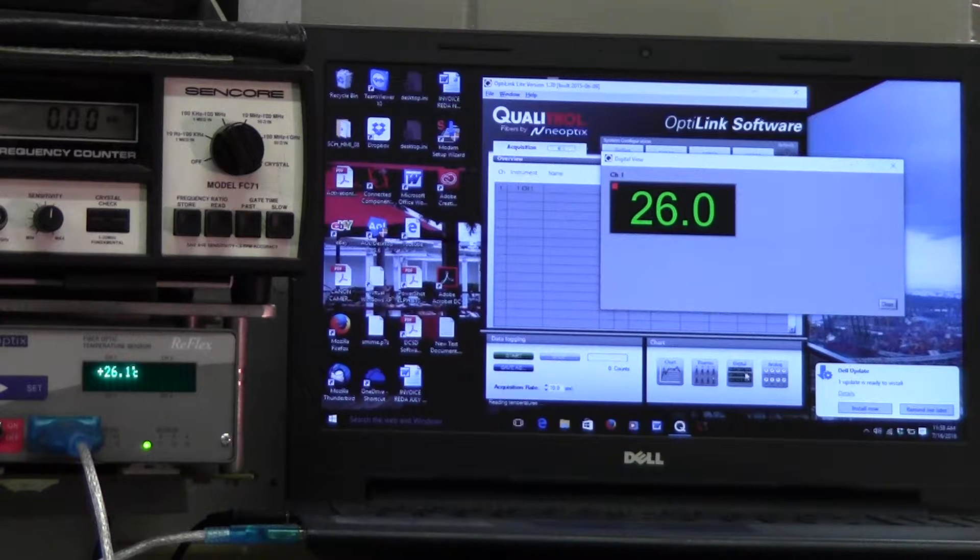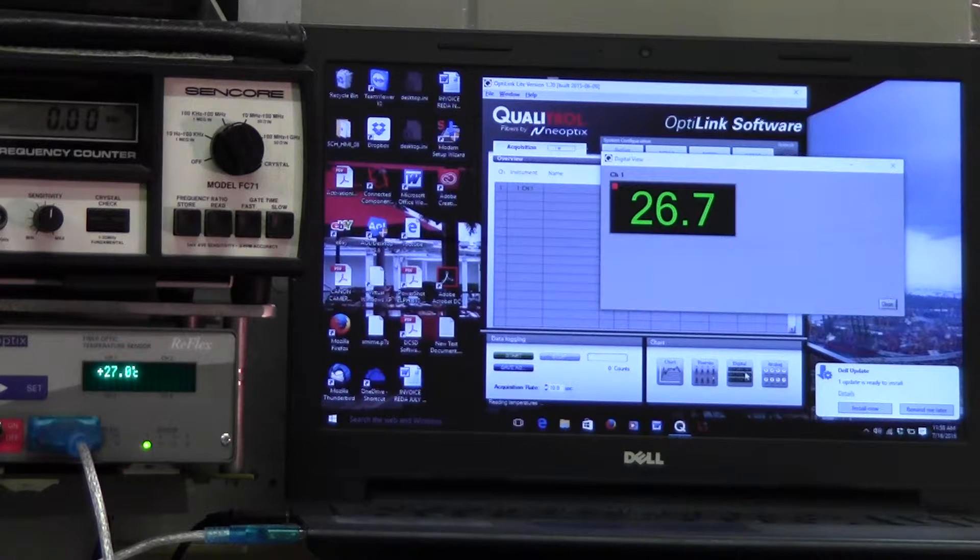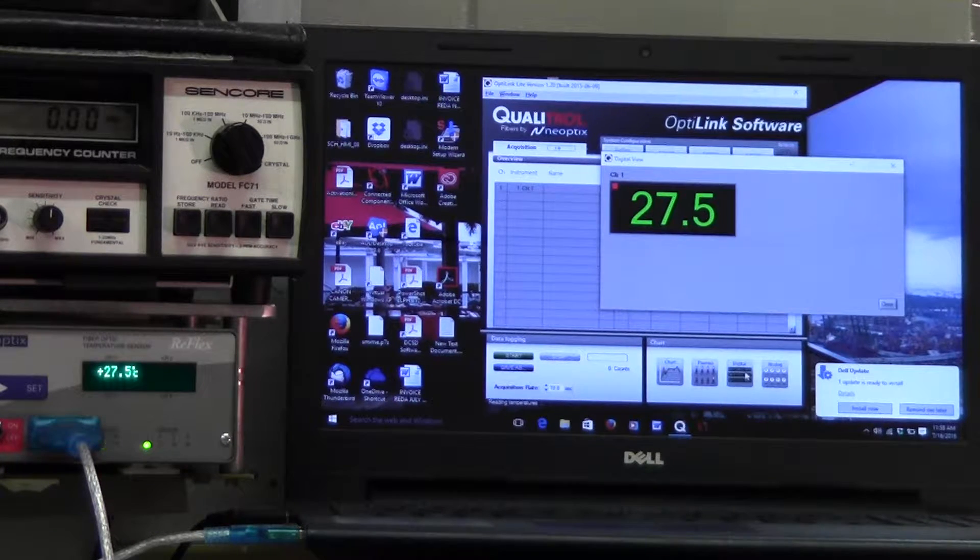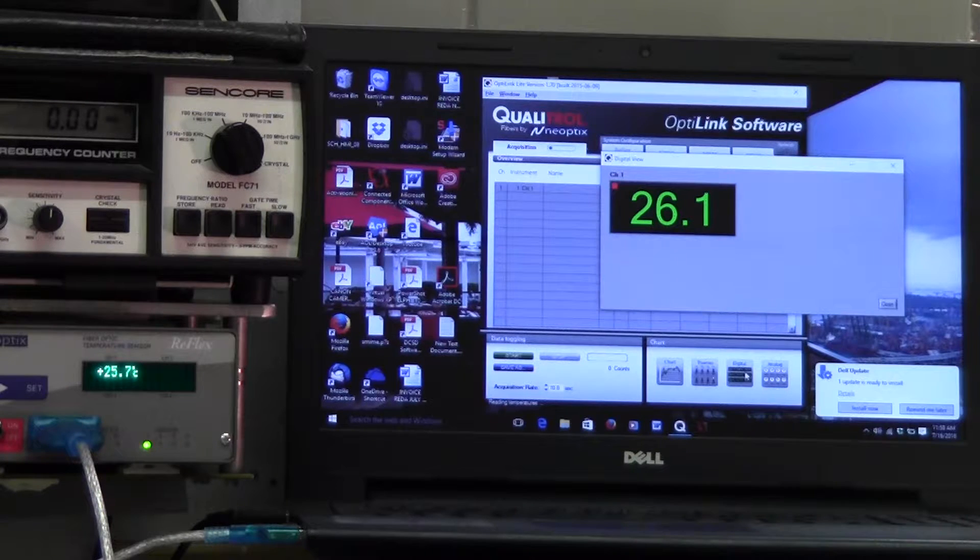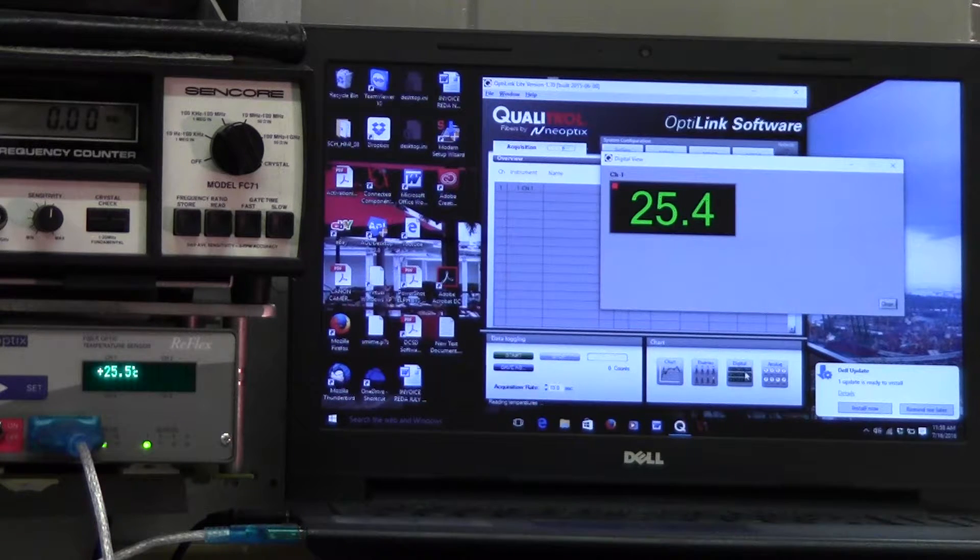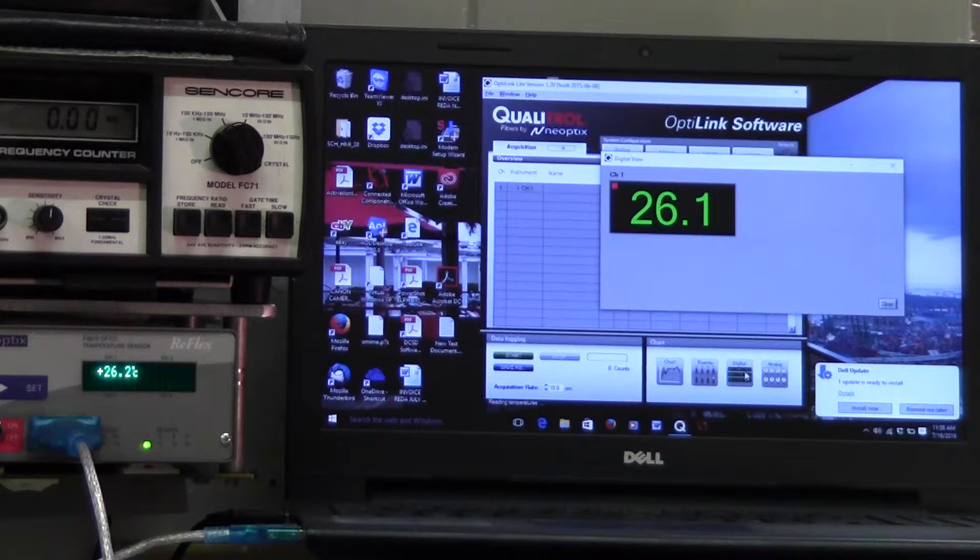Now when I step on the foot pedal, you'll see a temperature change almost immediate. Okay, I just stepped on the power. We're heating: one, two, three, four, goes right up. I'm going to take the sensor cable out again, remove the nanoparticles, put them in some cool water to lower their temperature again. And that drops it down.